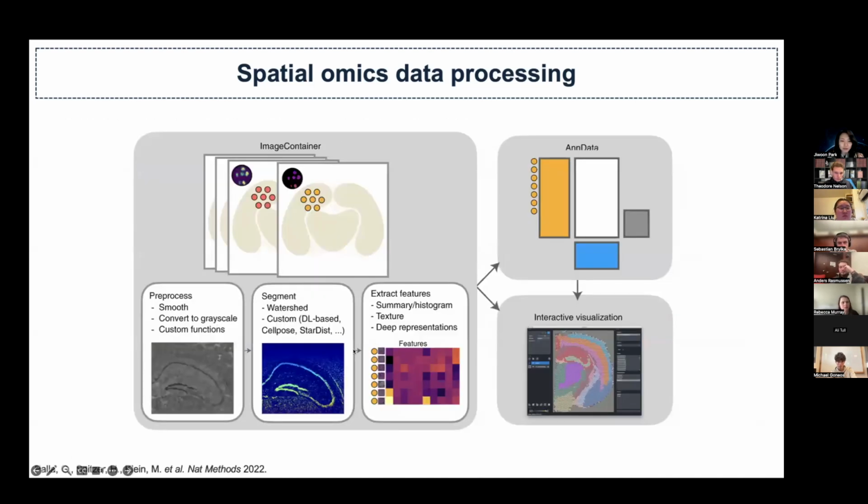So what pre-processing becomes is you take the images and process them so that they are smoothed and deconvoluted, so that we can identify individual dots or individual sequences. It also involves segmentation, where we can identify structures or images of the cells so that we can quantify these transcripts or sequences and map them back to the cells or XY coordinates. We can also extract features such as cell shapes, intensities of the transcripts, and intensity of the negative or control probes. At the end of the day, as I mentioned, count matrices and location matrices are stored in the form of an AnnData.